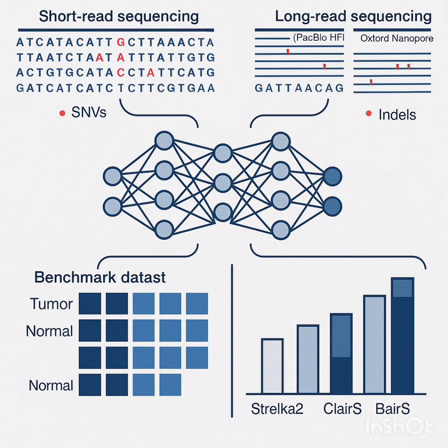Definitely. Now, you mentioned this multi-cancer boost. What's the tangible benefit? How much better is the model trained on all 5 cancer types compared to one trained just on that original single cell line? Right, they quantified that. And it's impressive. The model trained on the diverse multi-cancer set, compared to just the single HCC1395 line, cut down the total number of SNV errors by almost 40%. 40% fewer errors. That's substantial.